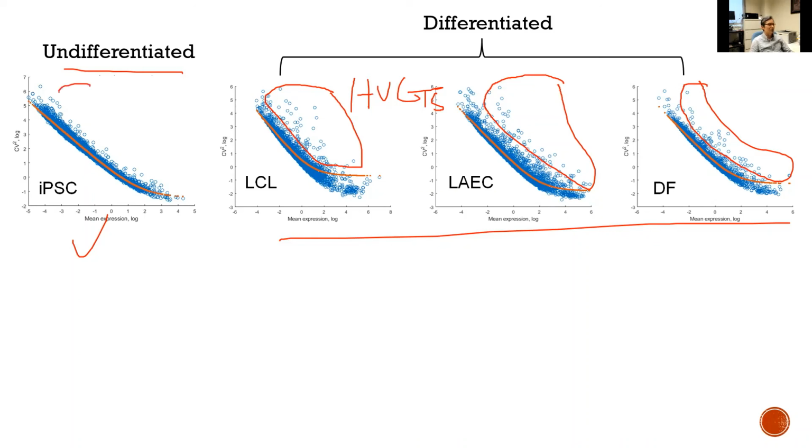So there are no highly variable genes. Okay, so we can see that using the feature selection function to identify highly variable genes not only helps to reduce the dimension and the burden of computation, but also measures the variability across genes.